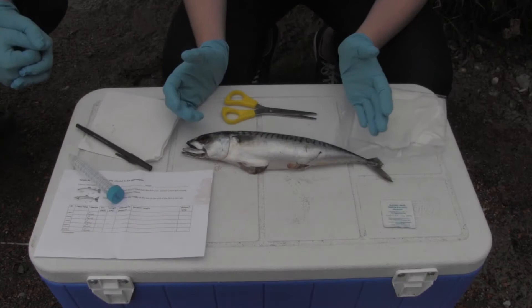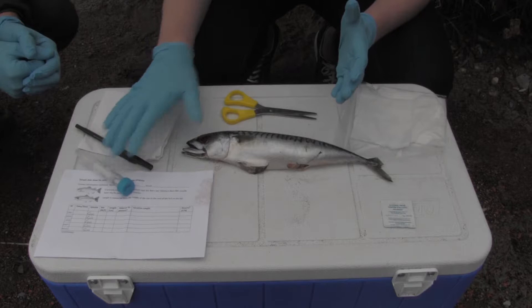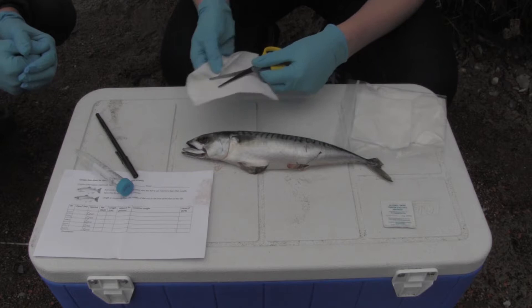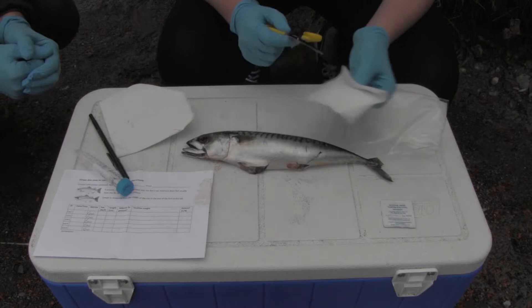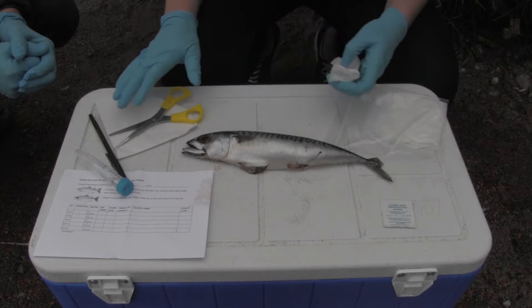The first step in sampling a fin clip from your fish is to put on protective gloves. This will prevent DNA contamination of your fin clip sample and protect you from the preservative. Then you're going to take your scissors or knife and sanitize them before sampling. First wipe them off with a paper towel to remove any debris or dirt, then take a bleach wipe from the kit and thoroughly wipe down your knife or scissors. Bleach will kill any contaminating DNA on the scissors, and we're going to leave it for one minute to make sure all the DNA is taken off.